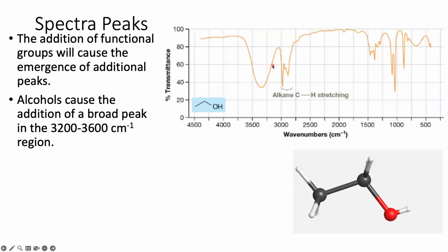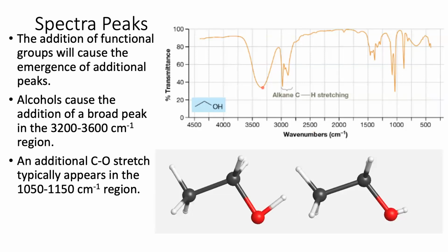This is also one of the reasons why you have to pay attention to whether or not you have water in your sample, because note this can look a little bit like water for a reason. But again, this sort of broad spectrum, which is fairly intense, is a good indication you probably have an alcohol present. Note that this is often coupled with a strong stretch around the 1000 region. So again, down here in this low region.